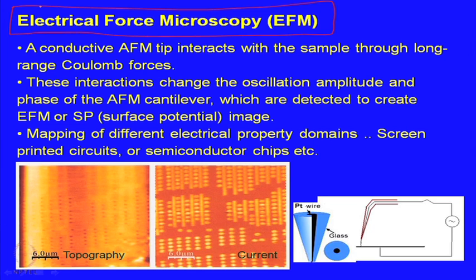Please do not forget that we are talking about an instrument which goes by the name atomic force microscope, and in no way is it limited to van der Waals force or van der Waals interaction only. That is important to realize. In most cases, irrespective of the material, the van der Waals interaction will be present, and therefore the normal modes like contact mode and tapping mode primarily work with van der Waals forces.